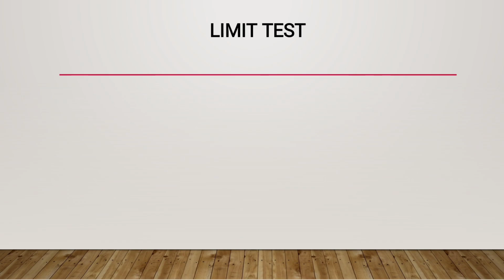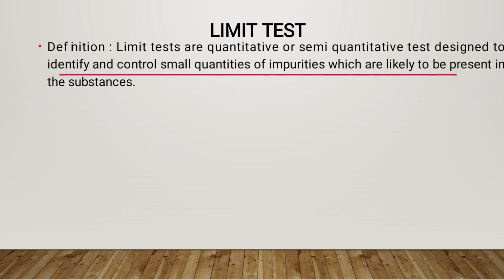Hello students, today we are going to study the limit test. What is a limit test? Limit tests are qualitative, quantitative or semi-quantitative tests designed to identify and control the small quantities of impurities which are likely to be present in a substance.